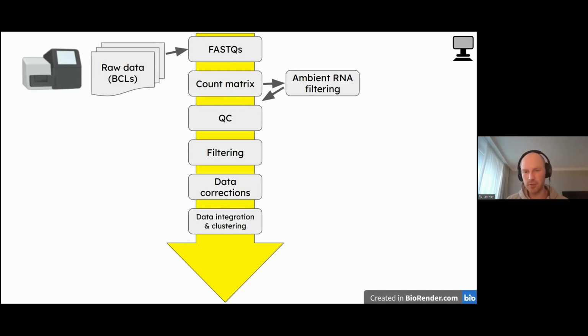So each individual cell, now, because we have high dimensional data, we need to bring each individual cell into a lower dimension so that we can later on use our data to do the clustering to find distinct clusters, and then do our cell annotation. So this is also a common step. It doesn't have to be, but it is a common step to do.